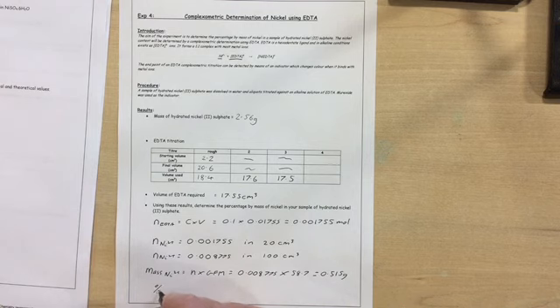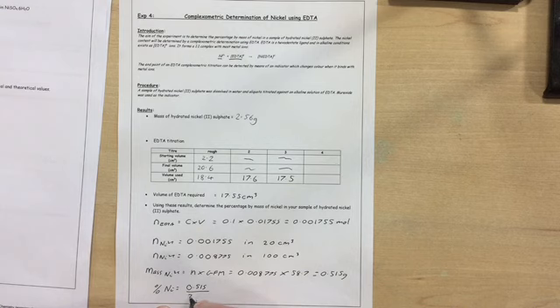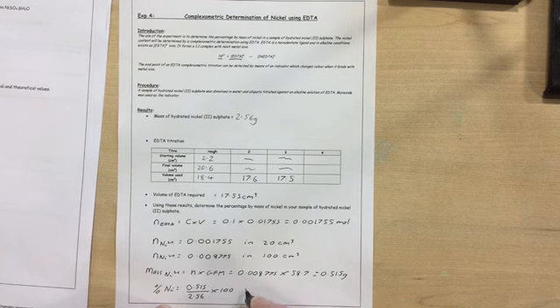So the percentage of nickel: out of that 2.56 grams, 0.515 was nickel. So 0.515 divided by 2.56 times 100 gives a percentage of 20.1 percent.